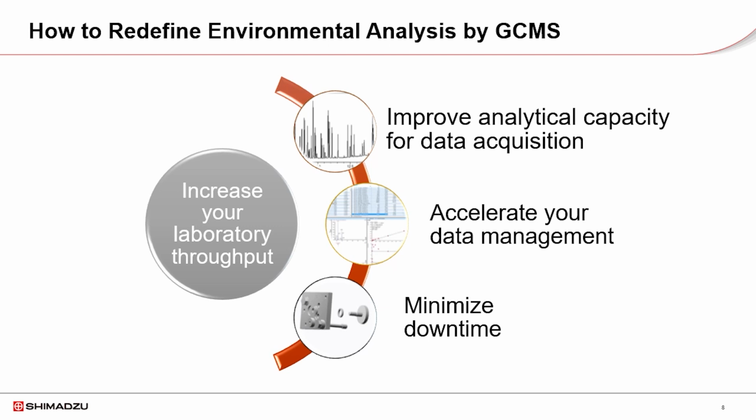Overall, they face three bottlenecks that prevent the increase in the throughput: limited analytical capacity for data acquisition, spending lots of time processing, reviewing, and reporting data, and spending also a lot of time taking care of instruments that might not be working.